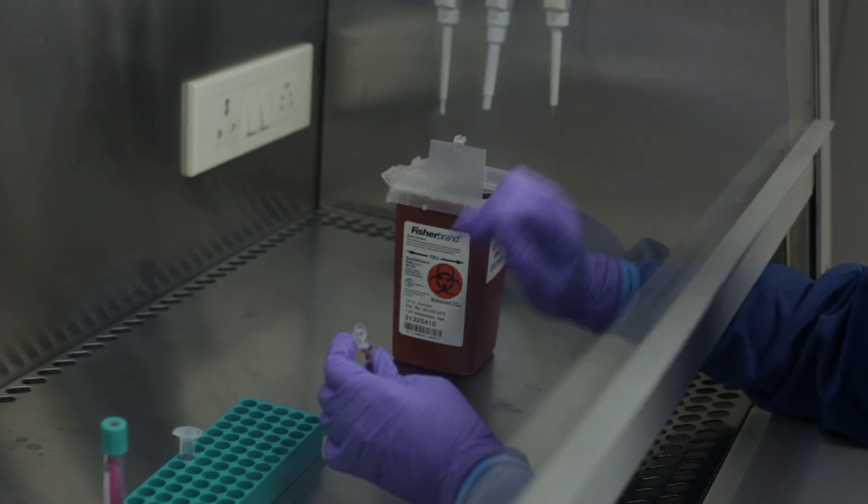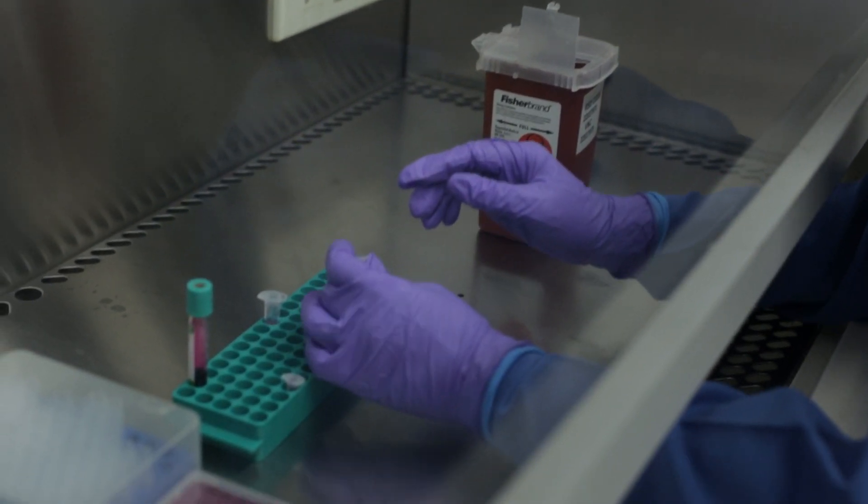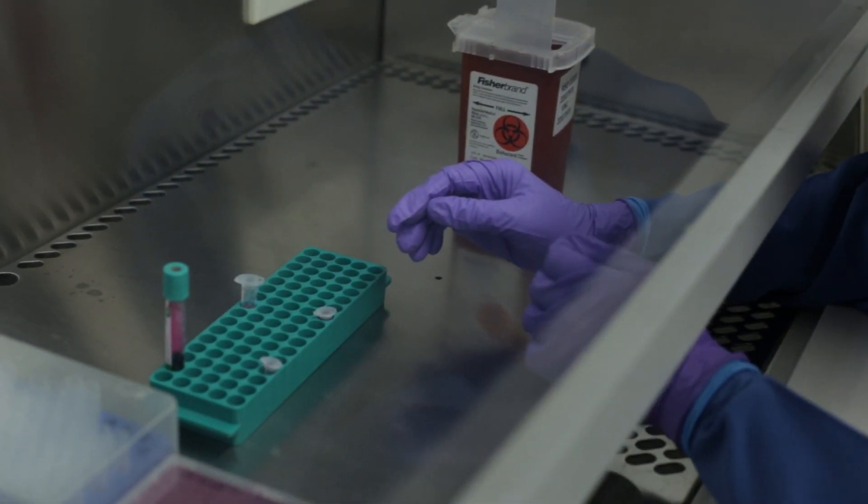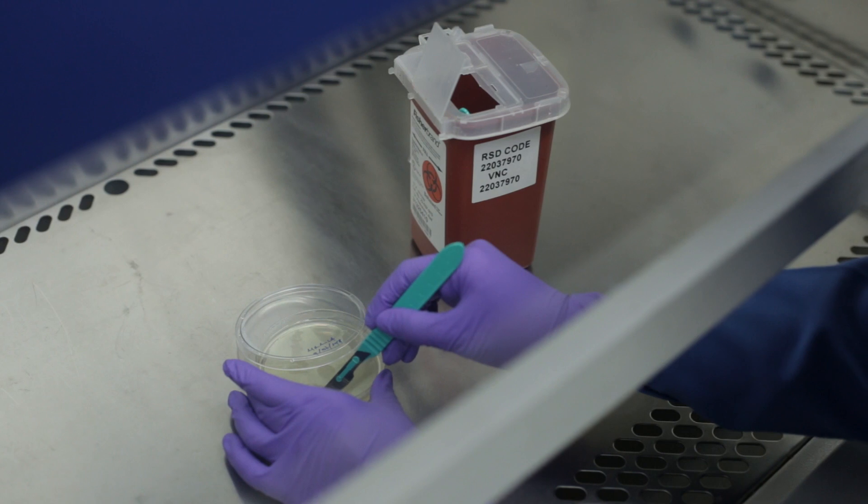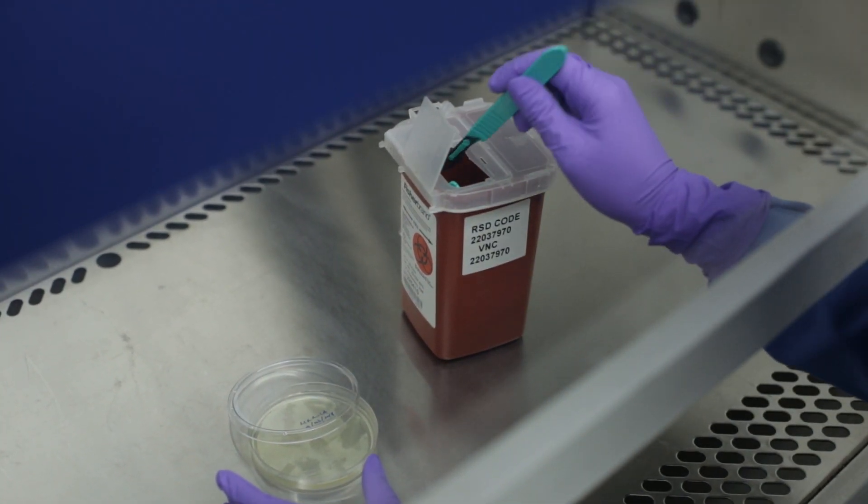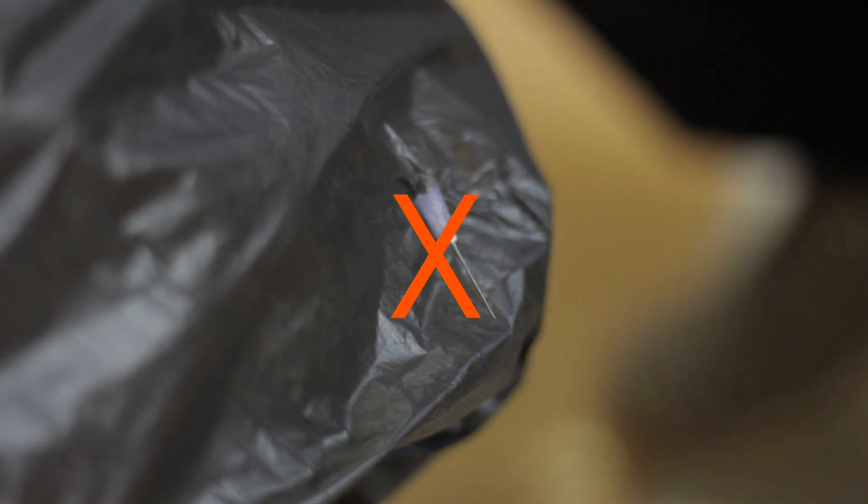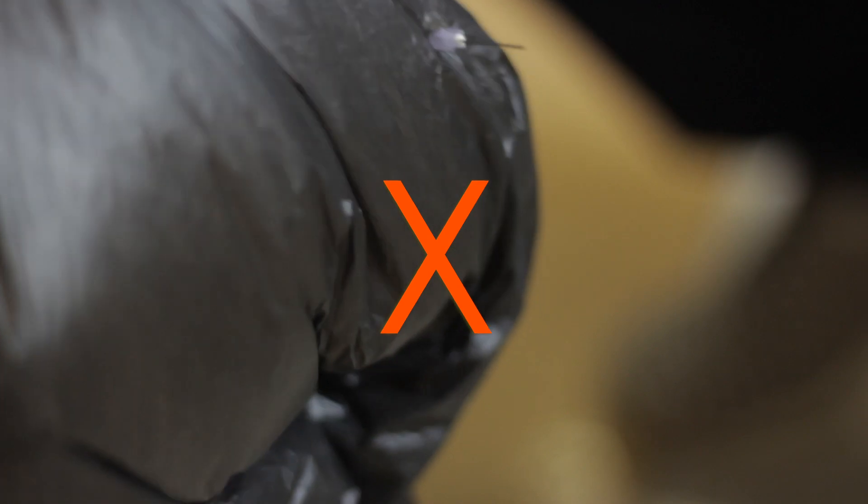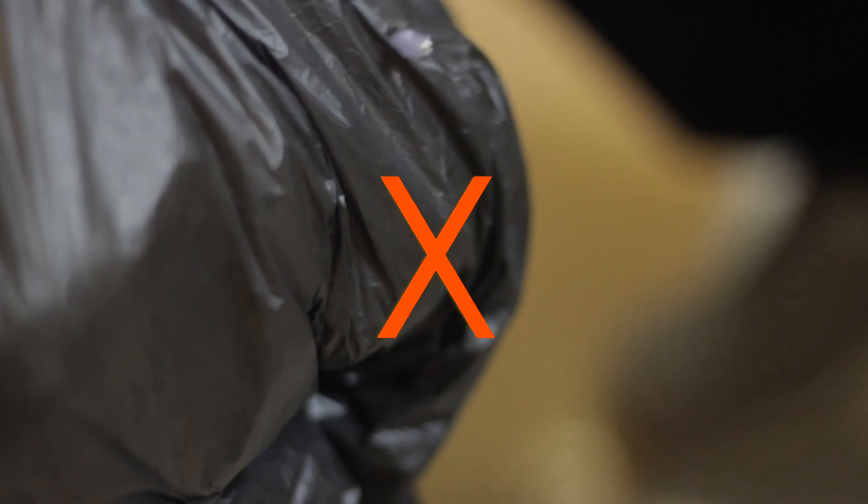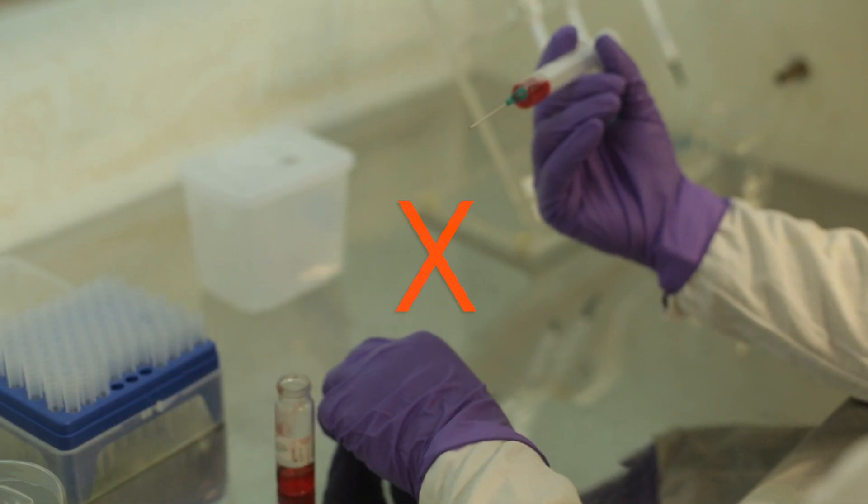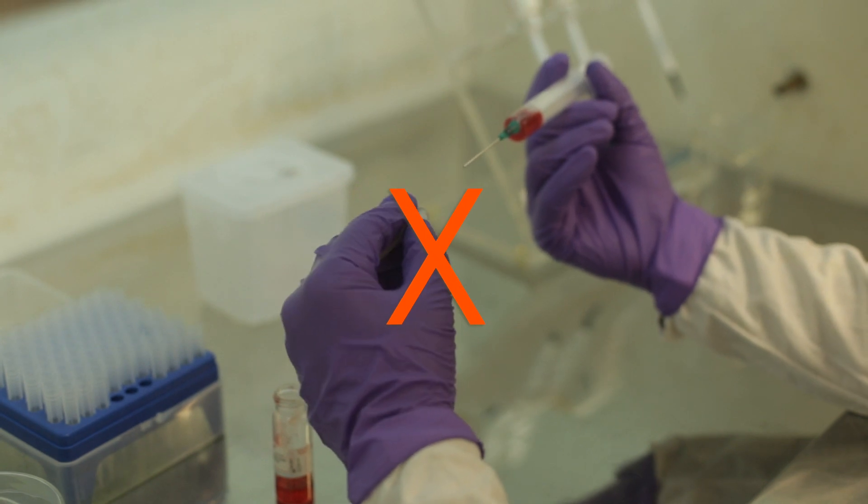Keep puncture-proof bins near the work area within arm's reach so that the syringe can be disposed of into the container immediately after use. The bin must not be overfilled. If you have to use scalpels, use disposable safety scalpels to prevent injury. Do not dispose of sharps into general waste containers as this can cause injury as well as infection to personnel who are handling these materials.